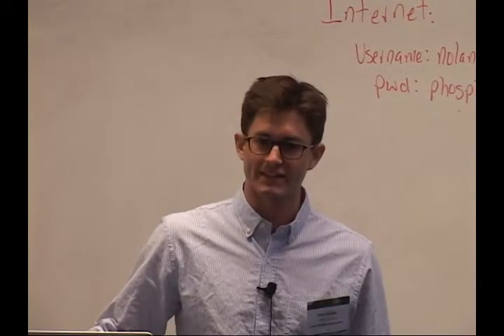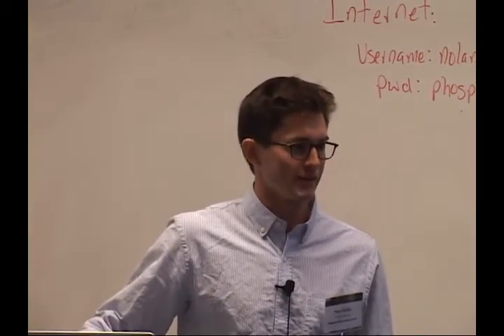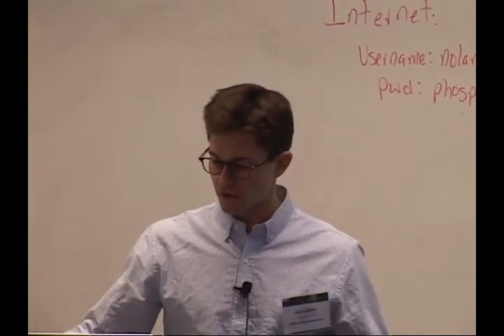Morning, everyone. My name is Matt Spitzer. I'm a grad student in Gary's lab, and as he said, I've been there for just a few months, so if there's anything to take away from this talk, it's really how quickly you can get up and running using this mass cytometry platform. Also, a lot of the concepts I'll discuss here in terms of reagent development, especially the titration segment, are also very applicable to work on a normal fluorescence platform.